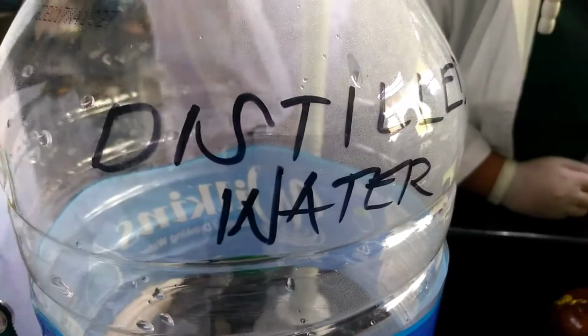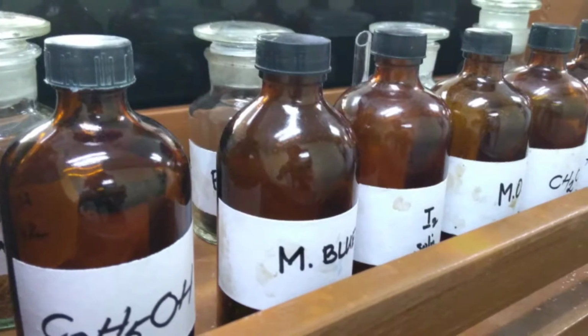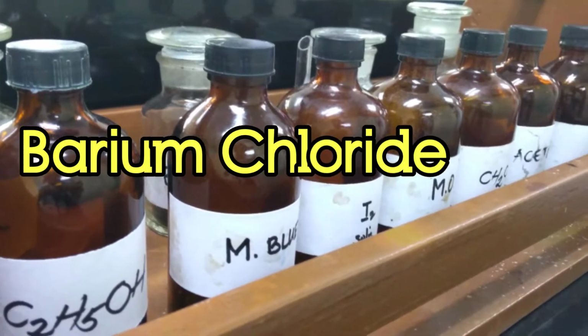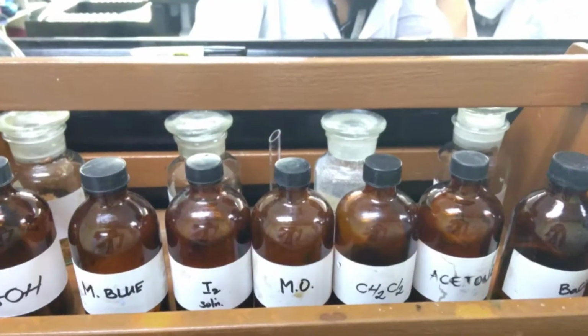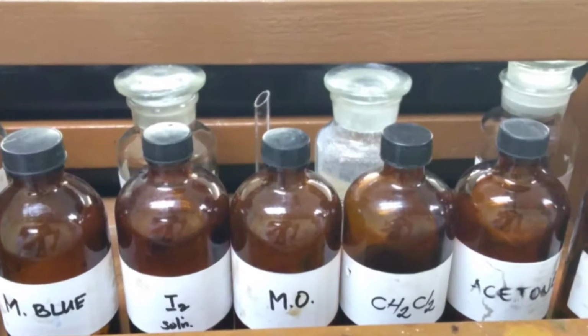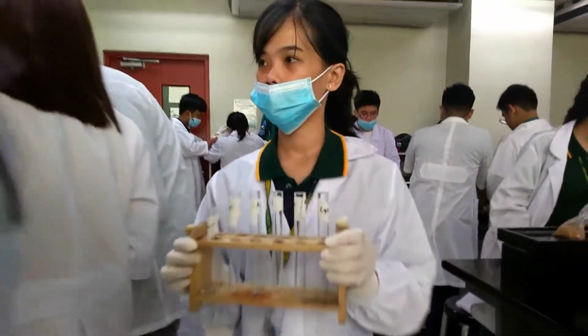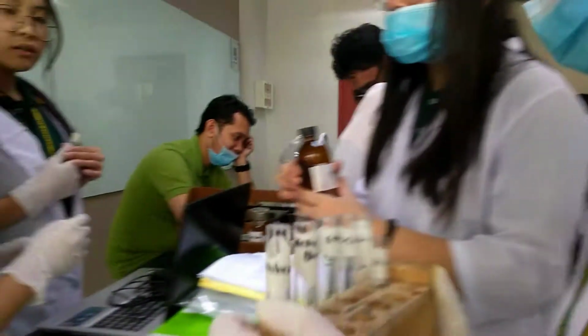The reagents needed are distilled water, benzoic acid, brown sugar, ethanol, bone black, Na2SO4, barium chloride, aqueous iodine solution, methylene chloride, acetone, cyclohexane, methylene blue, and methyl orange. You can get these materials at the assigned group at the front of the classroom.